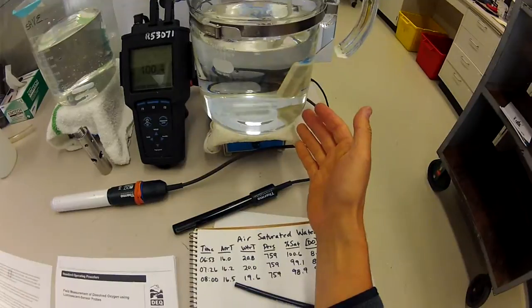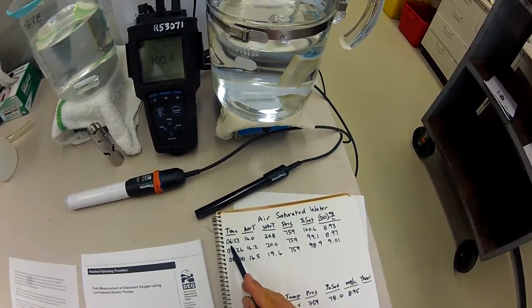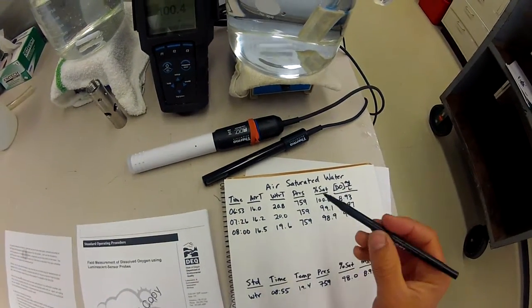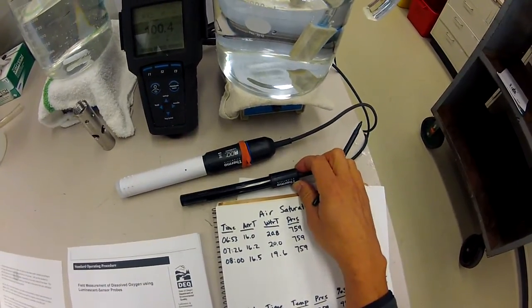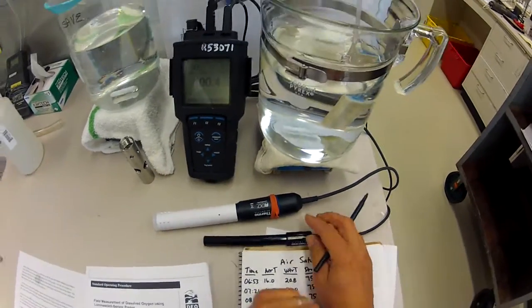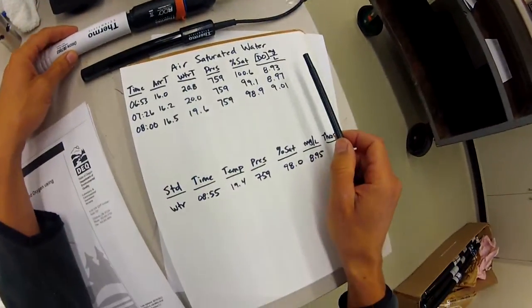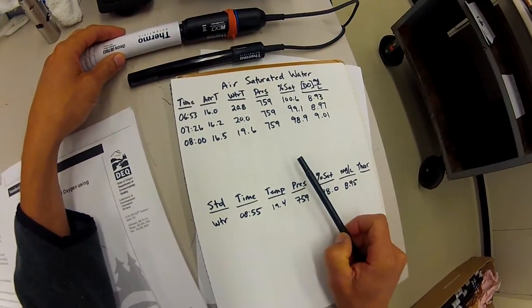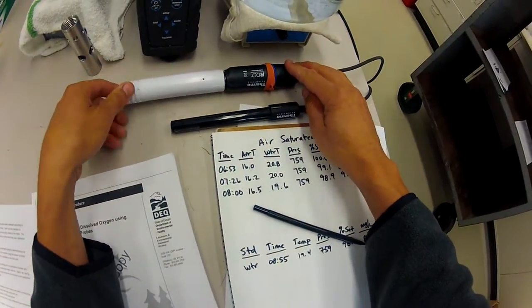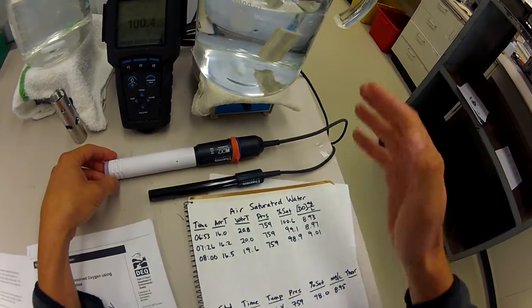What you'd want to do is let this sit for 30 minutes, doing this with the aeration and the stirring. You would want to record the time that you started, what the air temperature is. If you're able to use a DO probe, I recommend doing this - recording the temperature and having the probe in the water so that you can track the progress of the standard. Especially as you're learning the process and getting comfortable with the equilibration process, I recommend documenting what you're getting.